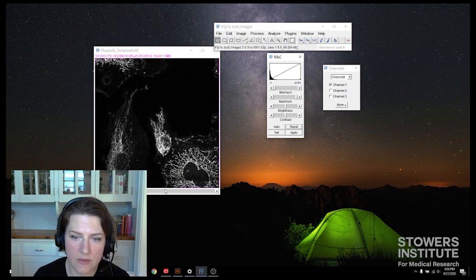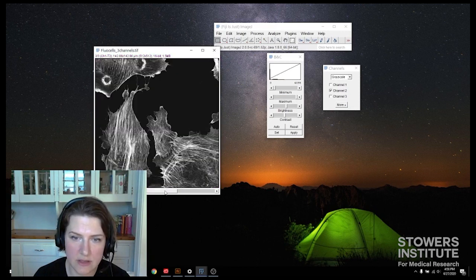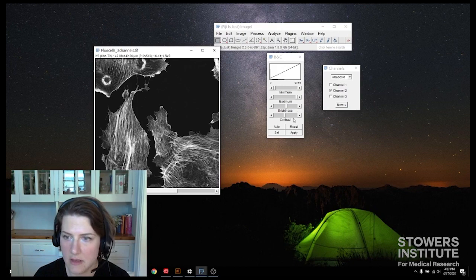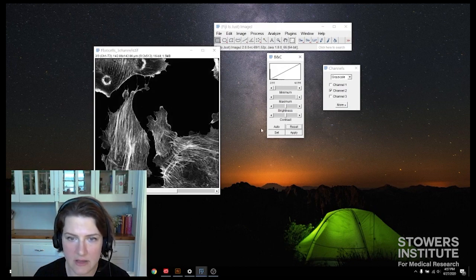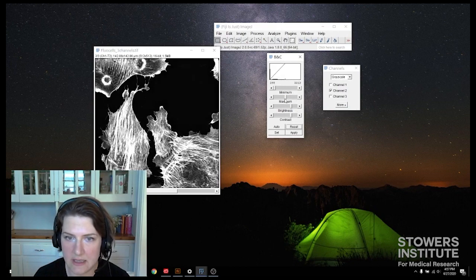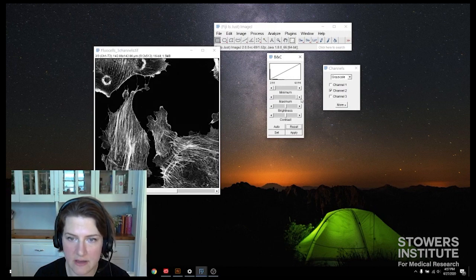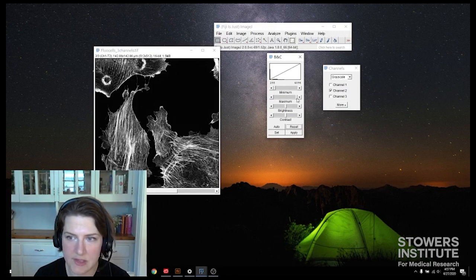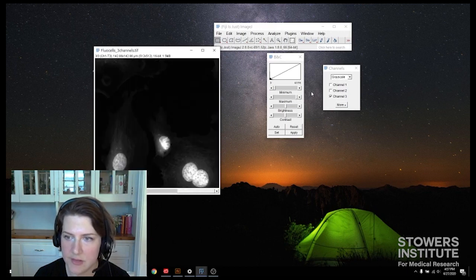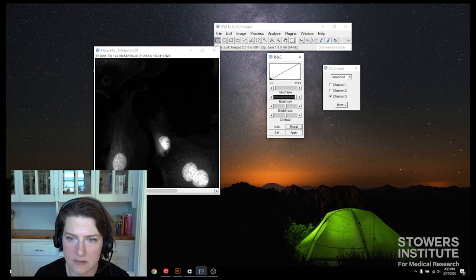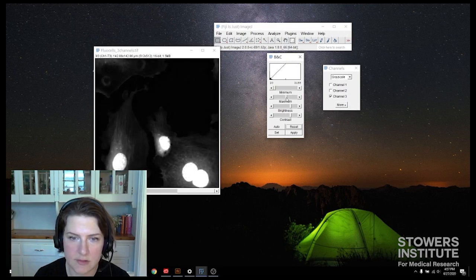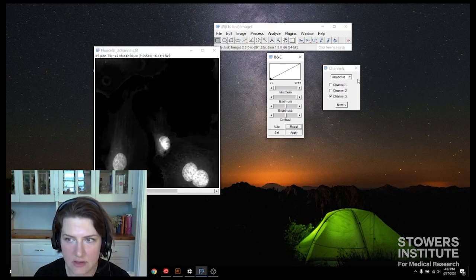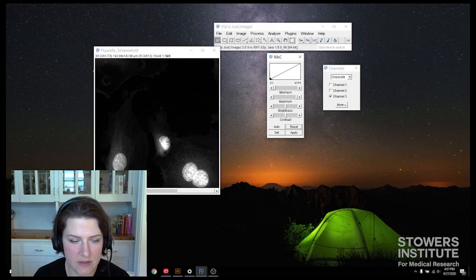So that one looks good. This one is a little high in the background. If I click reset, it sets and we can still see there's noise back there, which is good. And then finally our DAPI. That looks fine. Alright, so we've adjusted our brightness and contrast.